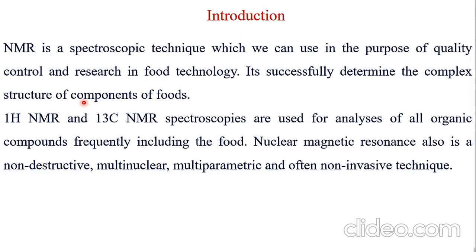Hello, today I am presenting my poster, which is titled An Overview of Nuclear Magnetic Resonance (NMR) Spectroscopy Technique in the Application of Food Technology. Coming to the introduction of my poster, NMR spectroscopy is a technique which we can use for the purpose of quality control and research in food technology. It can successfully determine the complex structure of food.